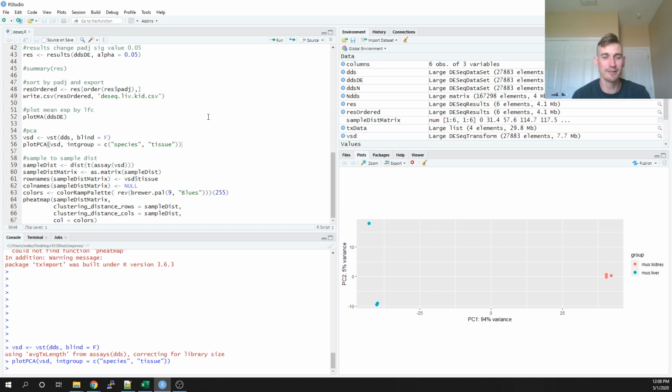So this one takes a little bit longer, and it's not because it's hard, it's just kind of tedious to get this plot the way we want it looking. But again, all it's doing is just comparing distances. And so the only command that's doing this is this sampleDist command. So again, nothing in R is intuitive. I don't know how this command is working, but what I know it's doing is just measuring the distances among the gene expression values of these log transformed data.